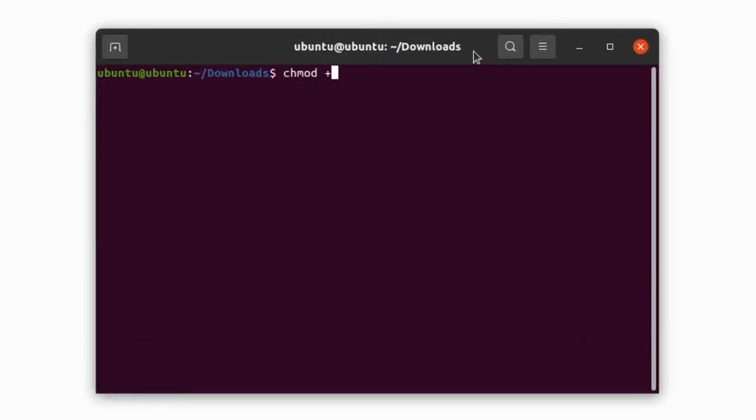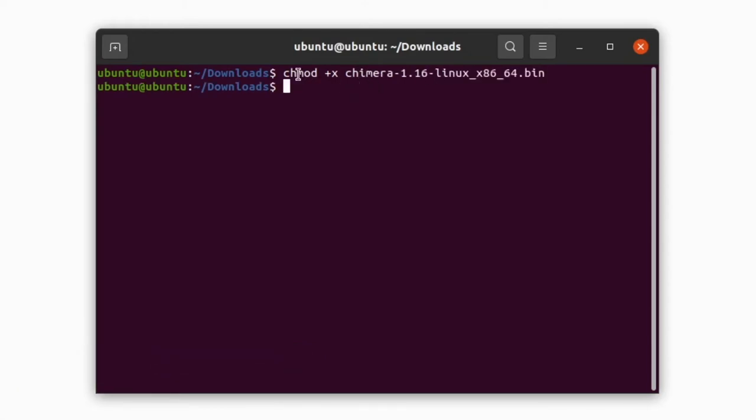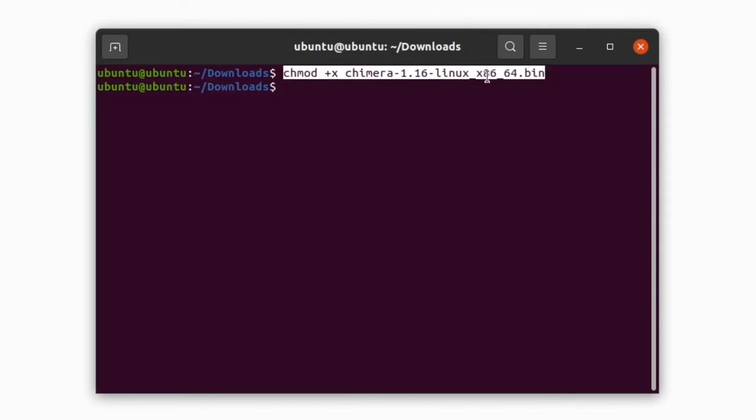First, change the file permissions to executable. Give this command: chmod +x and the filename.